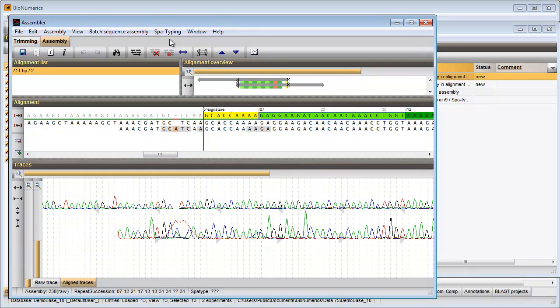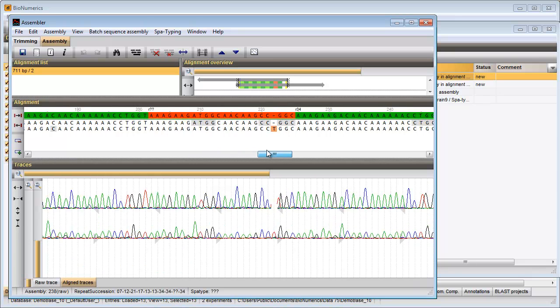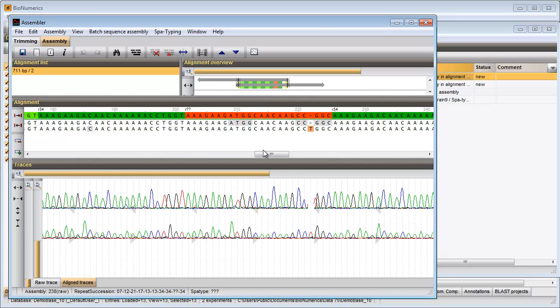The start and stop signatures are displayed in yellow. Known repeats are shown in green and the name is shown on top of the sequence. Bases that are not assigned to known repeats are shown in red.